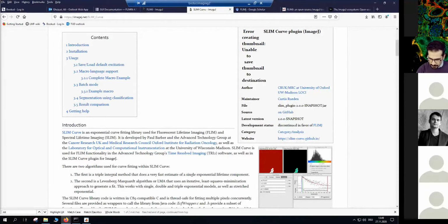Okay, so Liat is saying that even when converting to ASCII, you still have to edit the actual text inside before it can be opened. Yeah, so that's another point regarding open source software: there usually isn't a consistent team behind developing it, and usually they write the code. Master's students, PhD students, or postdocs have a project and the time to work on that, and they need a tool.